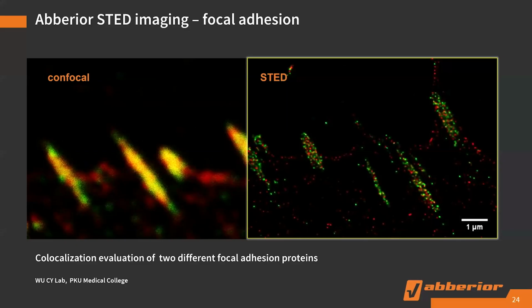The antibody he used is against the C-terminal of the protein. With our system, the resolution is so high that where you label the protein will influence the data quality. The interaction happens at the N-terminal, while the labeling is at the C-terminal. They're apart from each other. Obviously, you see nothing, right?